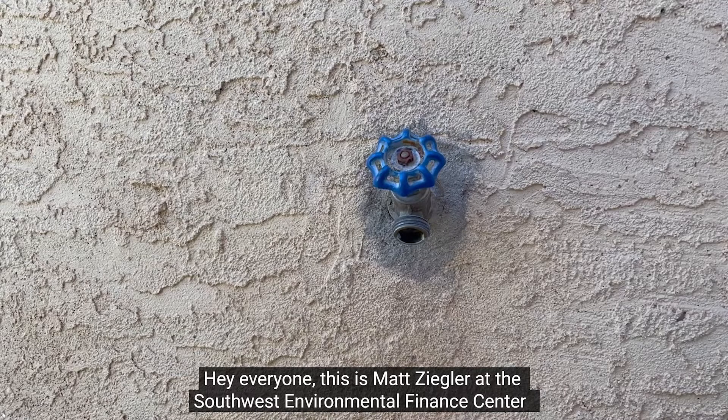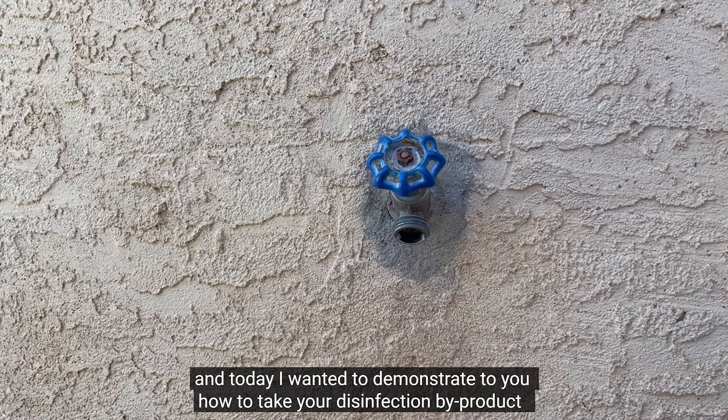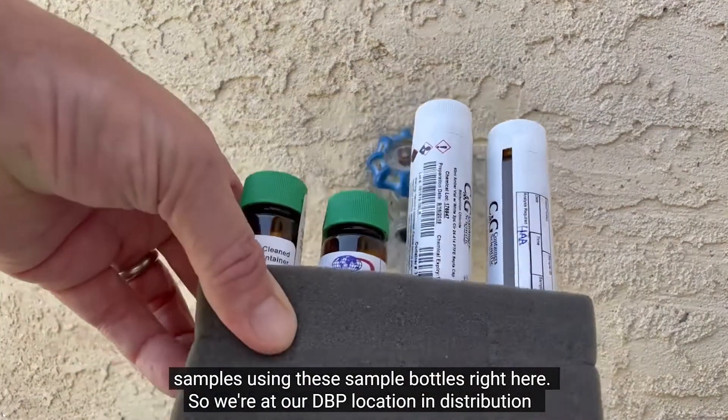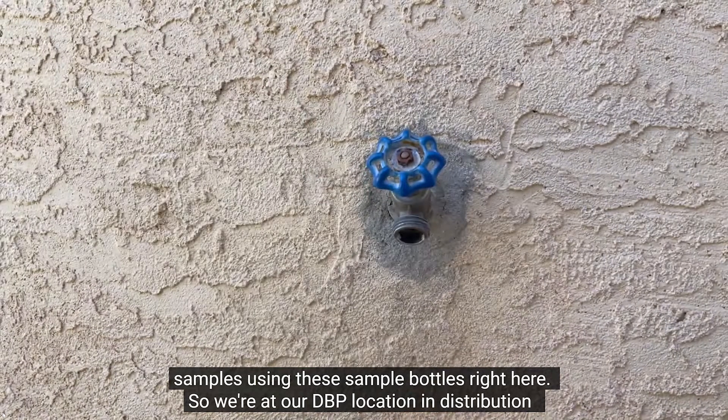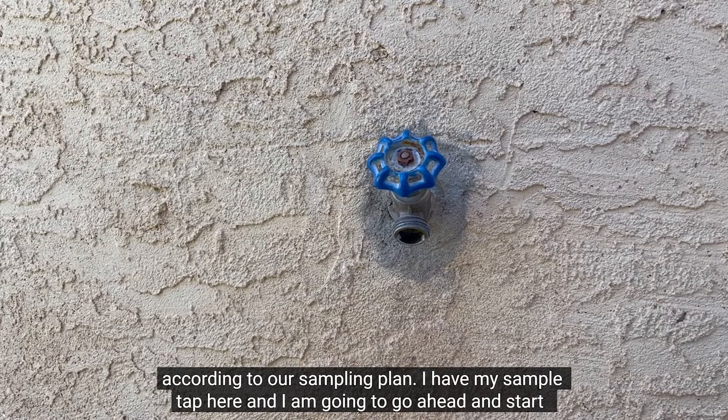Hey everyone, this is Matt Ziegler at the Southwest Environmental Finance Center. Today I wanted to demonstrate how to take your disinfection byproduct samples using these sample bottles right here. We're at our DBP location in distribution according to our sampling plan.